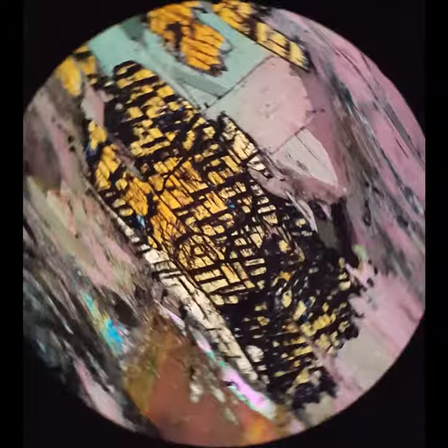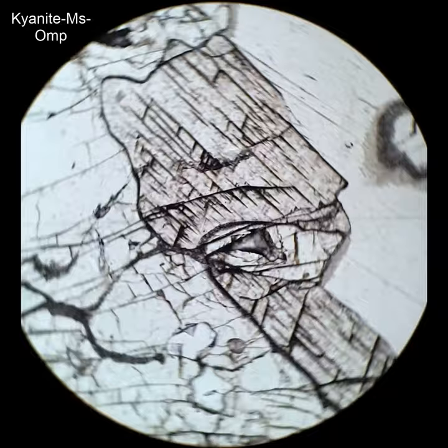Really typical to see these low interference colors. This is kyanite in an eclogite, and again you can see the long thin cleavages and the short cross hatching, the parting. It has very high relief.